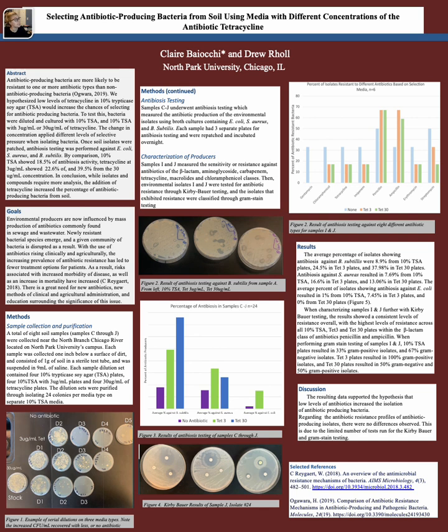And what I found was that I did about 24 samples from my data set, and there was the highest amount of antibiosis in Bacillus subtilis, which makes a lot of sense because Bacillus subtilis is a very common soil microbe. And now I knew that these antibiotic-producing bacteria could grow on tetracycline, so that means something. They can produce antibiotics. Now I want to see how many different types of antibiotics they're resistant to.